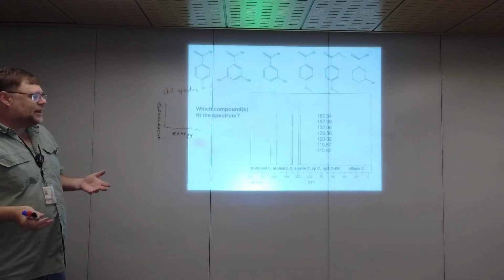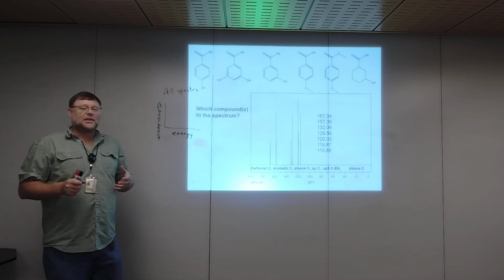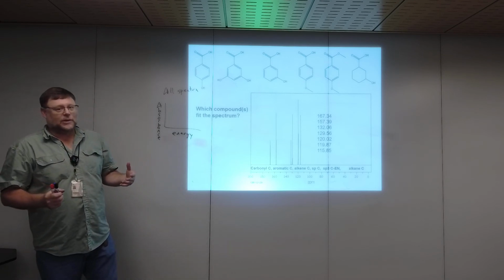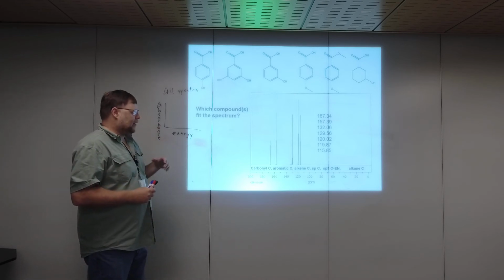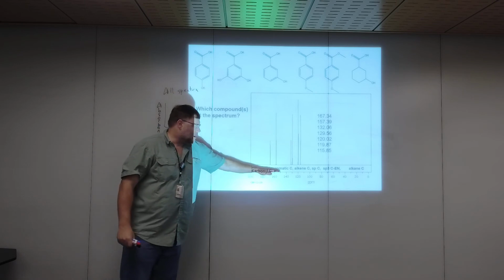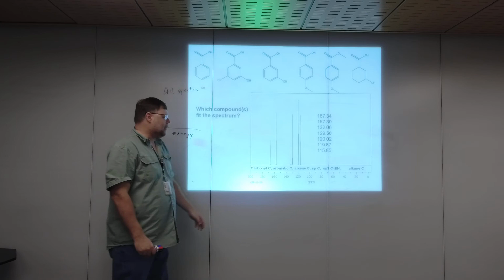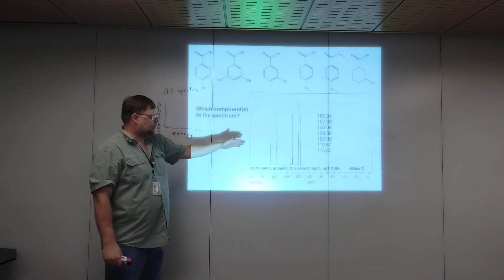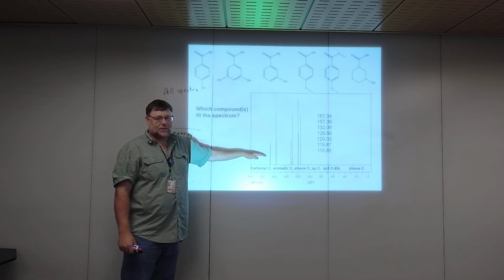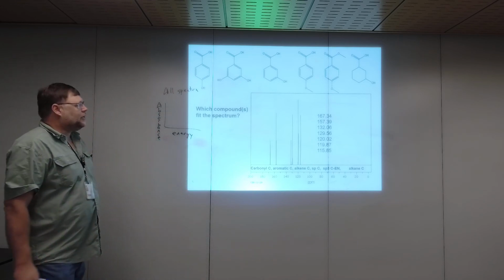All right, so just like in that last exercise with the infrared spectrum, this becomes a process of elimination. You can't really use C13 NMR to piece together an entire molecule either. You can get a lot more information than an IR, but not quite enough to do the whole thing. Again, I've put what type of carbons fall where on the chemical shift axis, giving you 6 candidate molecules. And I've given you a C13 NMR spectrum, and I'm asking you to tell me which molecule fits. Molecule or molecules, doesn't have to just be one. So hit pause and give it a try.